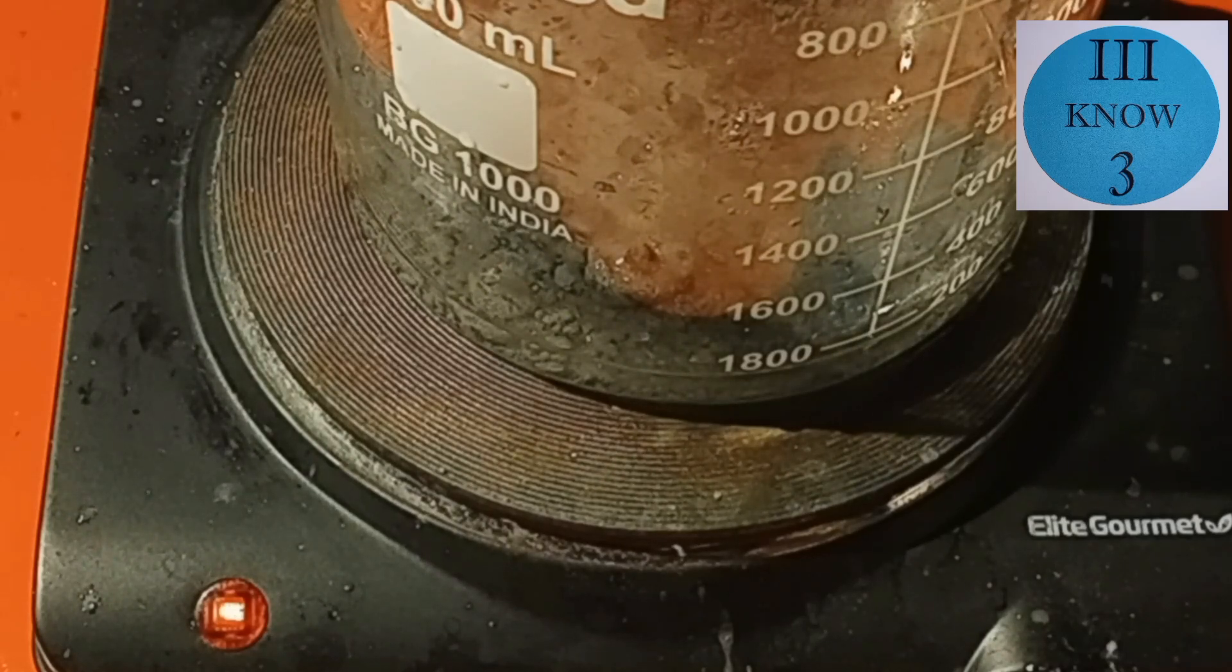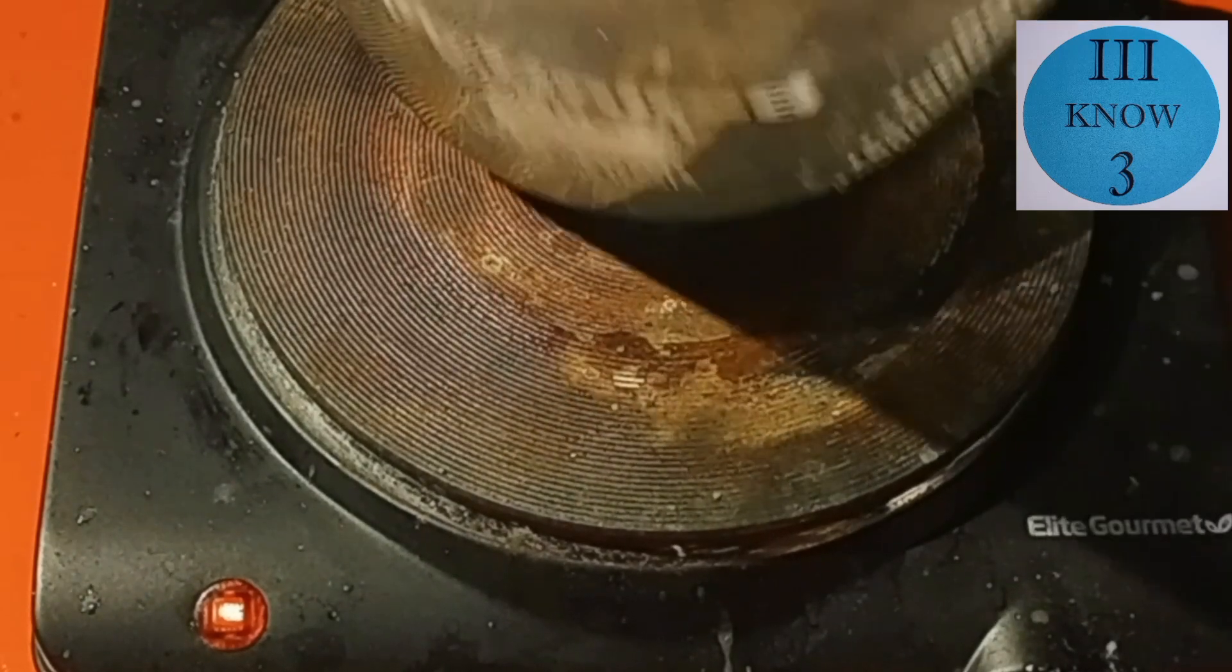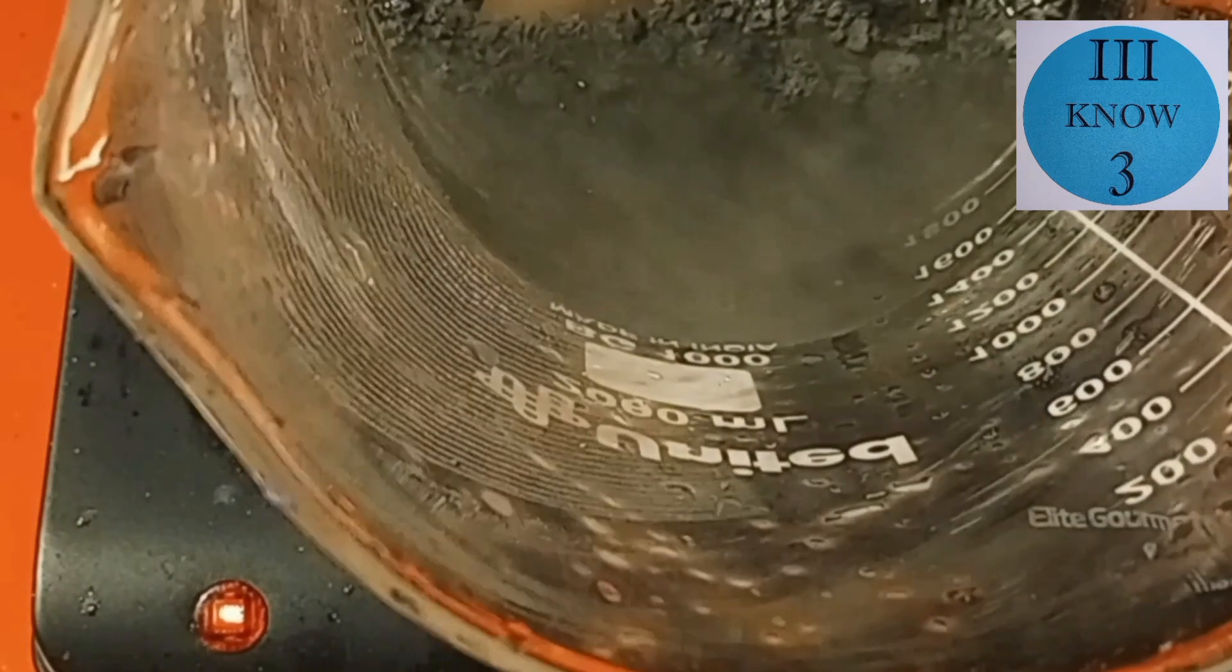We started with a tin ingot that was supposed to be 96% pure that we melted down in the melting tin metal video. And right now we're running this on low heat.